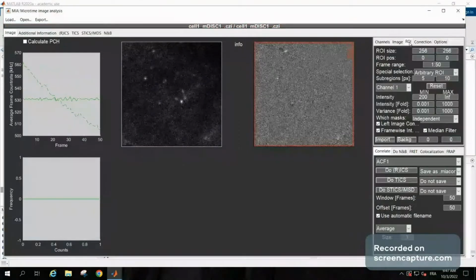So what you do is you also threshold these regions, which are very high in intensity, and to do that you use the maximum channel. Now I see that on average it's about 600. So this pixel is slightly more than the average intensity. So I'm going to give it 800 to see how it gets thresholded. I also see that in some cases, pixels like this also get thresholded, which is not entirely necessary. So you increase the intensity to exclude the low intense regions from the analysis.